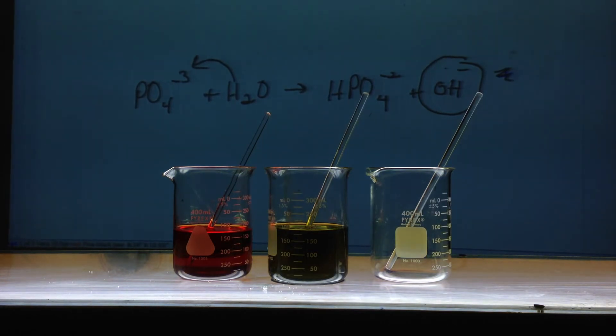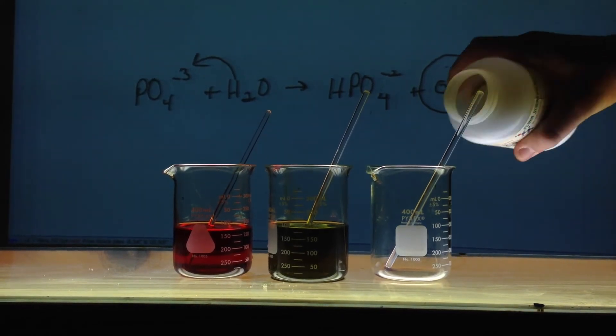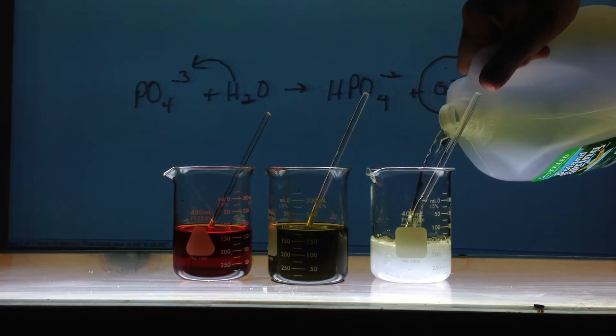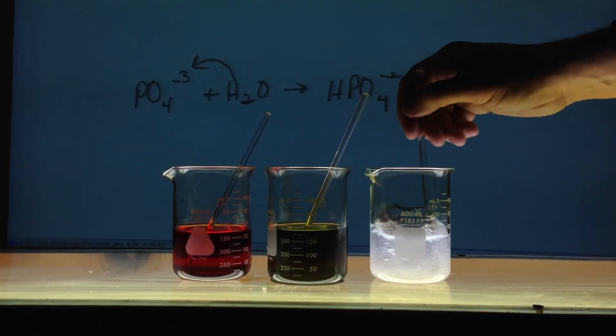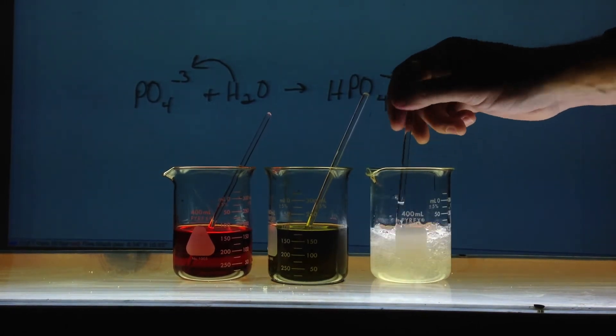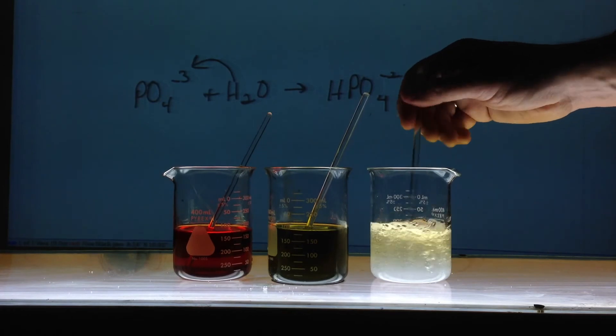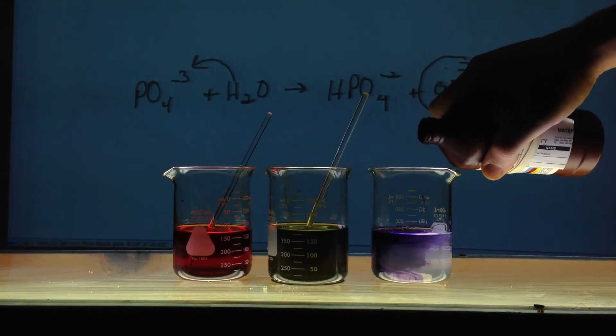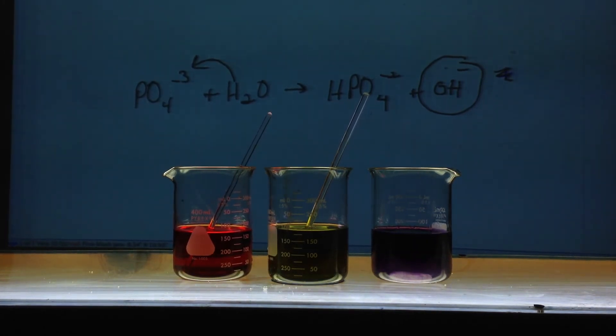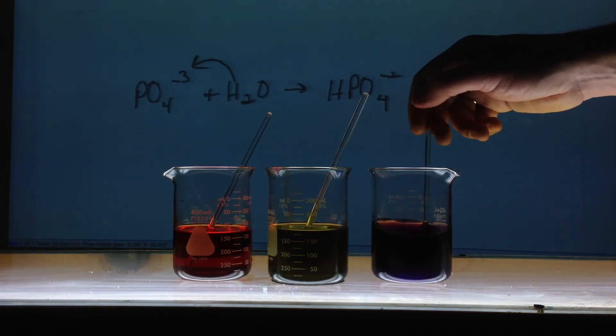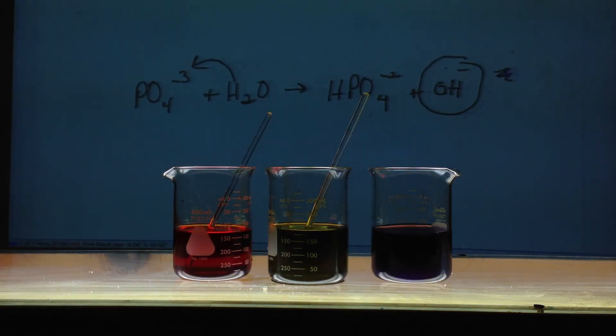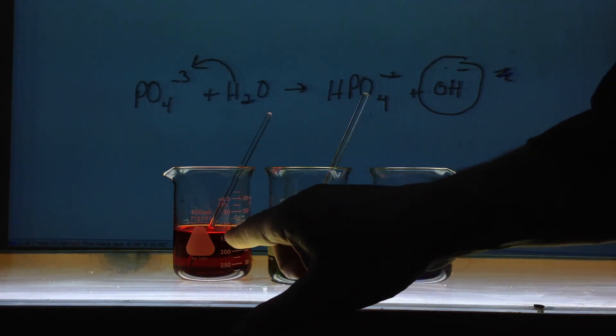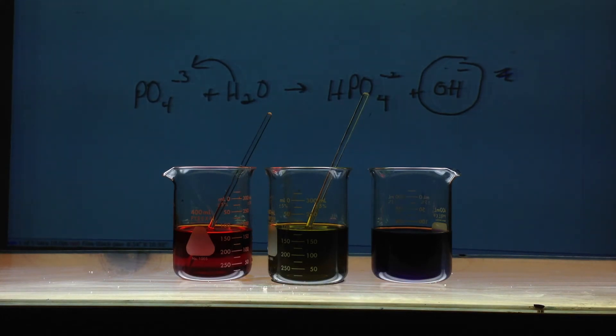Let's add some sodium phosphate, a white salt. It doesn't have a transitional element. Dissolve it. And, let's add some universal indicator. And, we should see colors that make the phenolphthalein and the blue make a purple color. The pink color from phenolphthalein and the blue color from bromothymol blue mix to make the purple color. And, there we go with our basic salt for Na3PO4, acidic salt for the ammonium nitrate, and the neutral salt for sodium chloride.